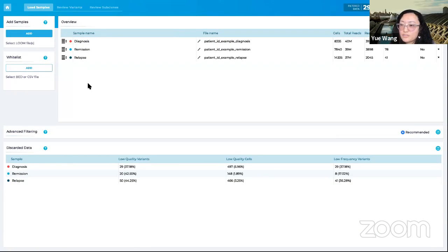And a way to maybe save this situation is that you could downsample, you could downsize your sample so that you don't have that deep sequencing data there.